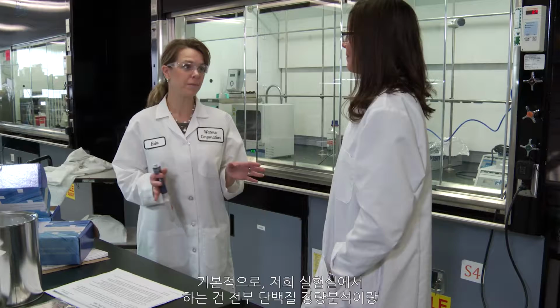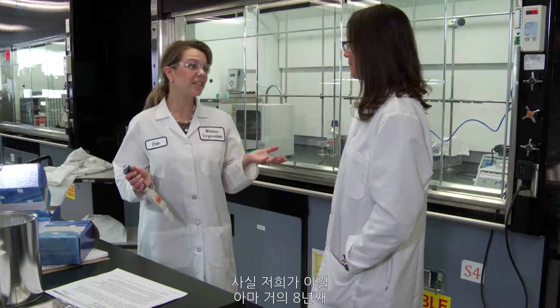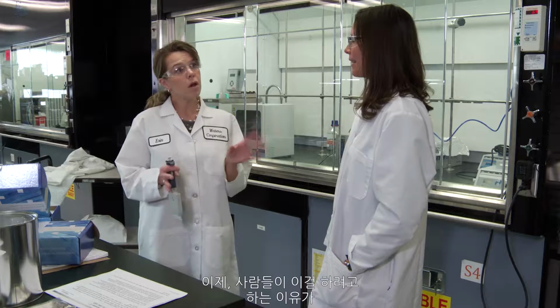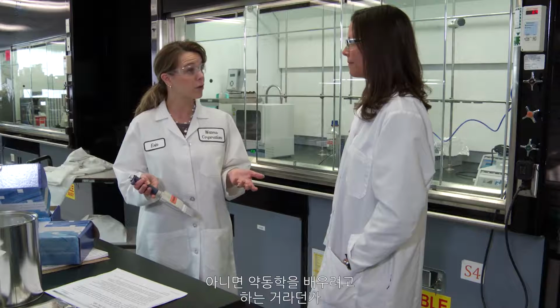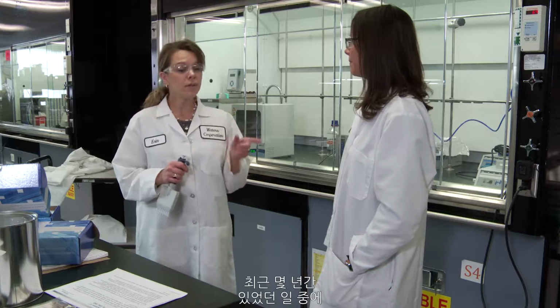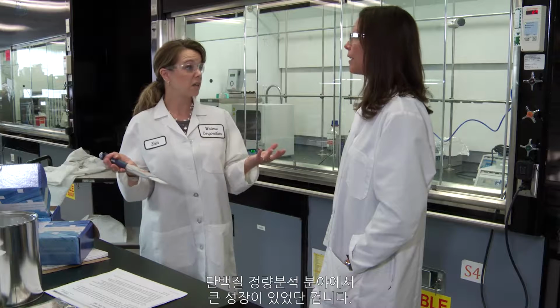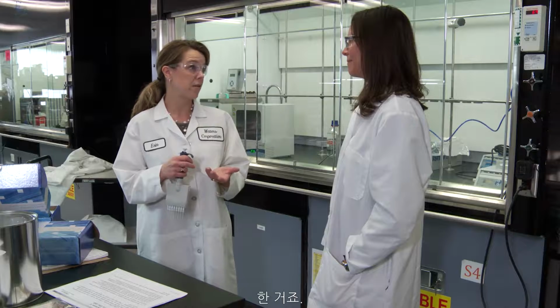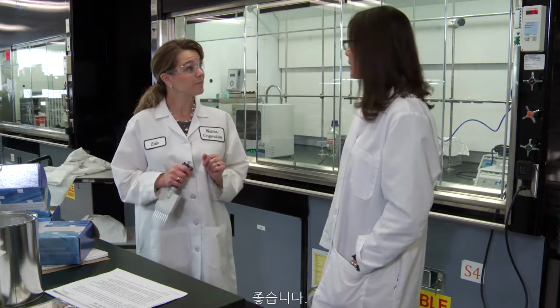Basically, all we do in our lab is protein and peptide quantification. We've been doing this for probably 8 years now, and we've recently really streamlined and refined it. One of the reasons people do this is to look at up or down regulation of biomarkers, or to study pharmacokinetics or pharmacodynamics of drugs. Over the past few years, there's been a real growth in large molecule quantification, which led us to research heavily in this area. There are a few common techniques that people use, and I can show you.